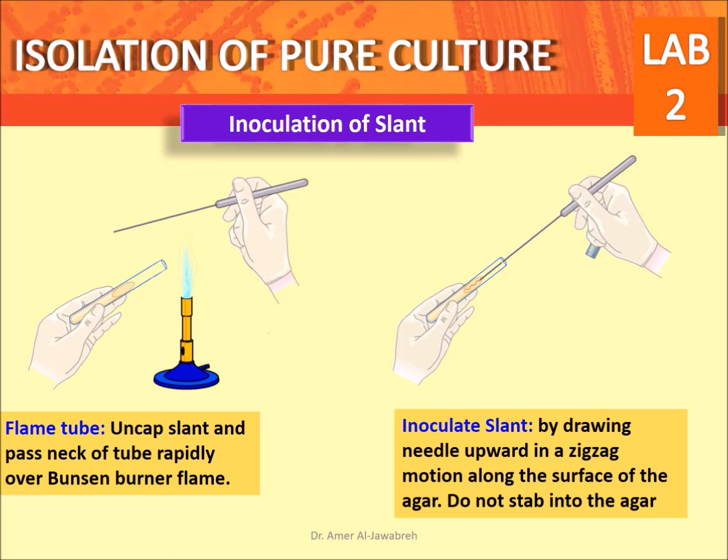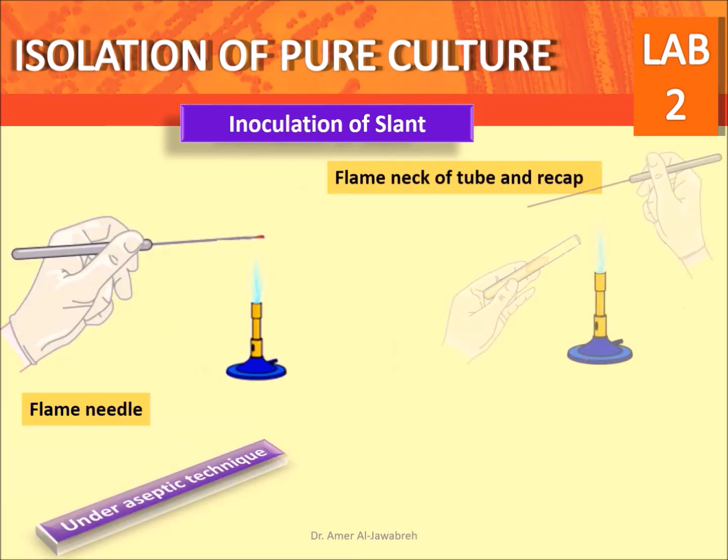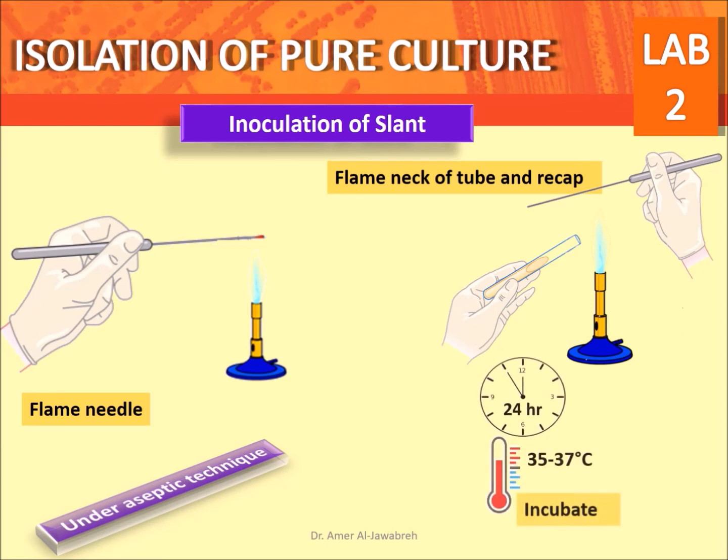Inoculate the slant by drawing the needle upward in a zigzag motion along the surface of the agar. Do not stab into the agar. Then flame the needle. Flame the neck of the tube and recap. Afterwards, incubate for 24 hours at 35 to 37 degrees centigrade.